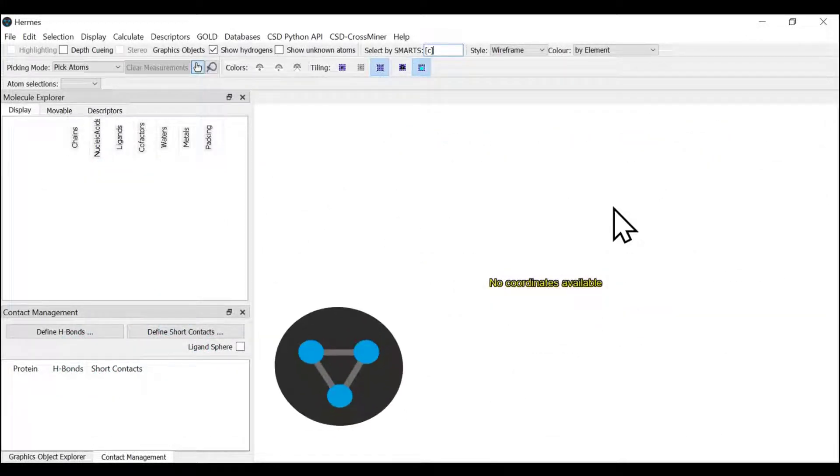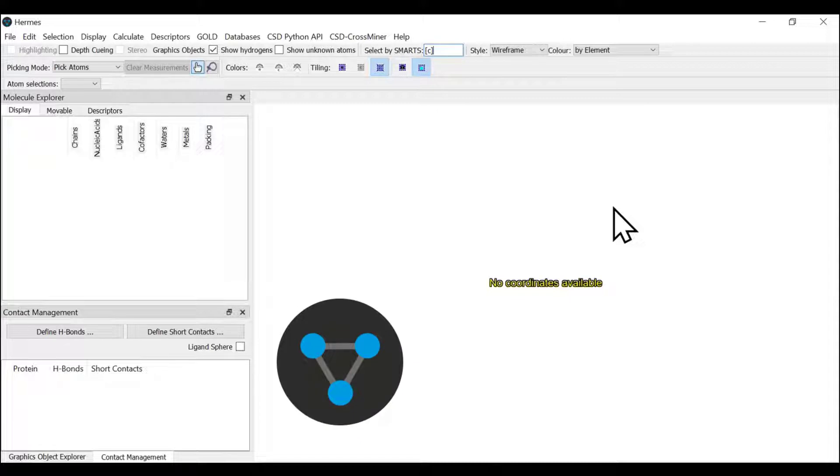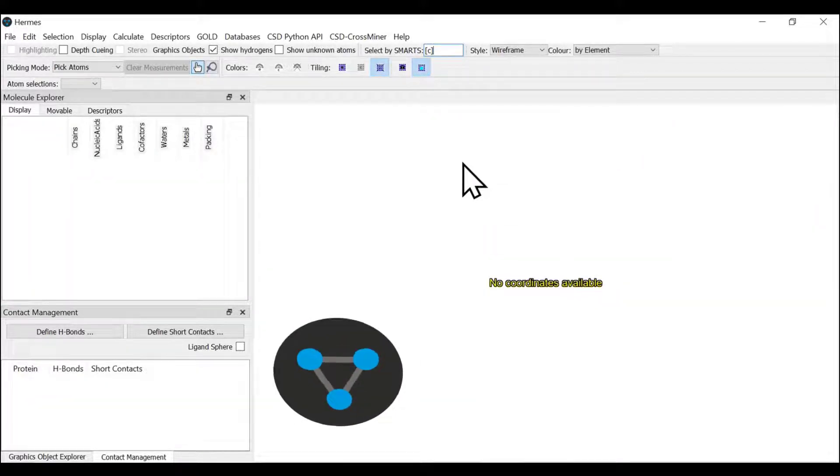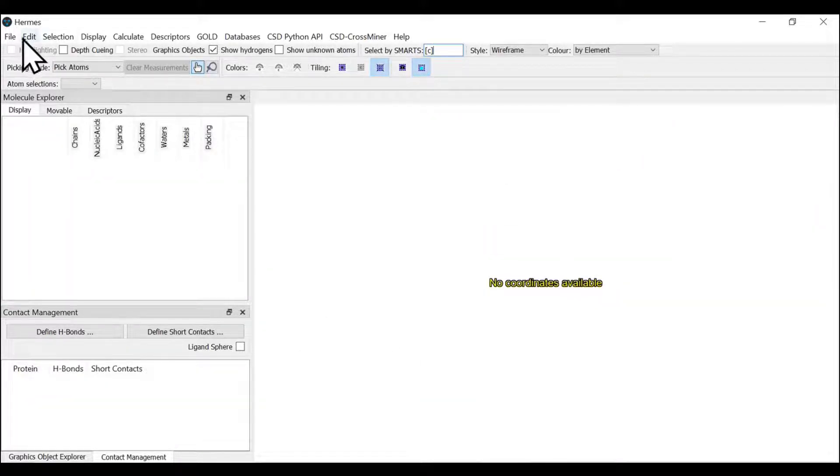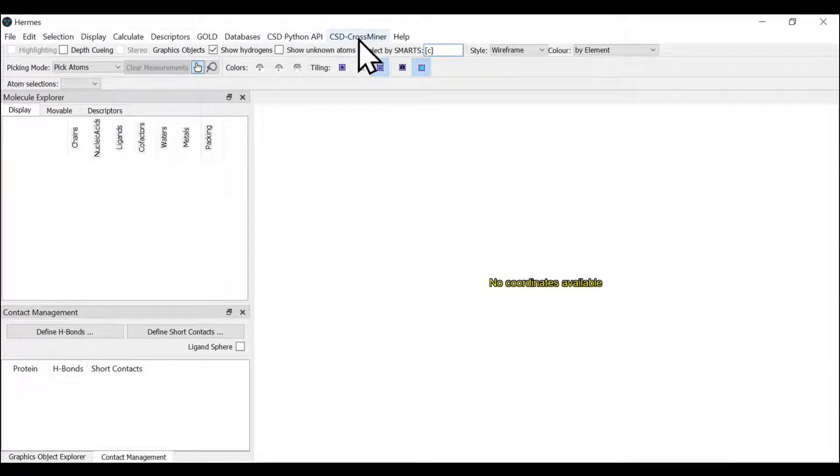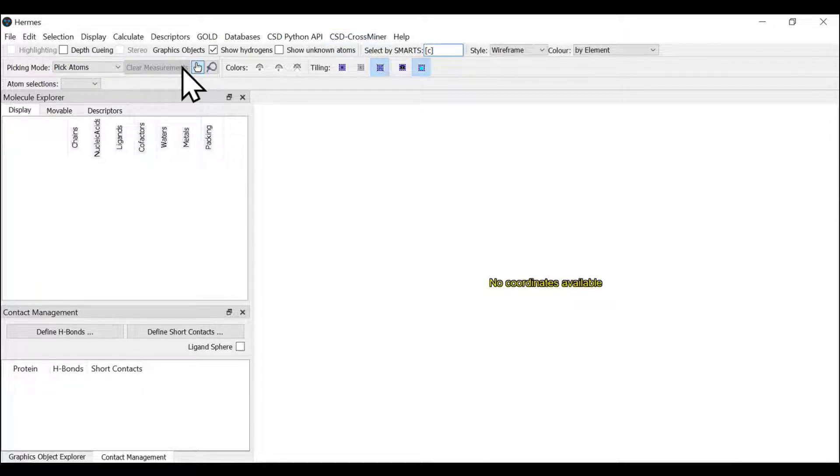You can launch Hermes from your desktop. This is the Hermes interface where you can find GOLD, CSD Python API, and CSD Crossminer. These are various discovery tools that can be launched from Hermes.